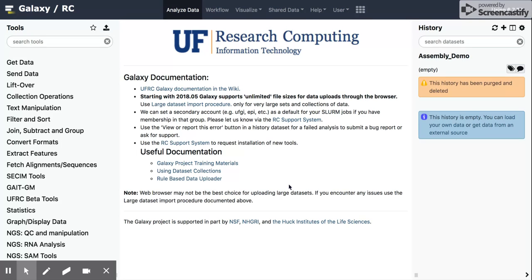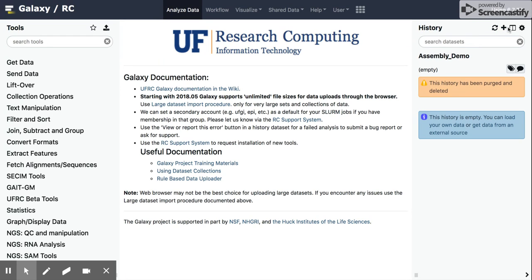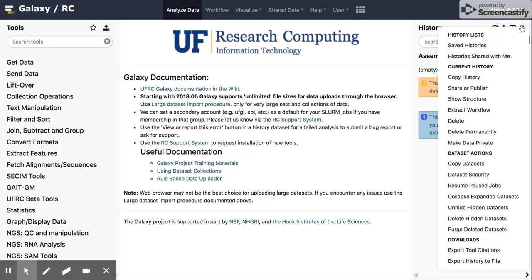So the one I'm going to focus on today is this history tab. And if we hover over these buttons to the right, we can see there's a couple options here: refresh history, create new history, view all histories, and then history options.